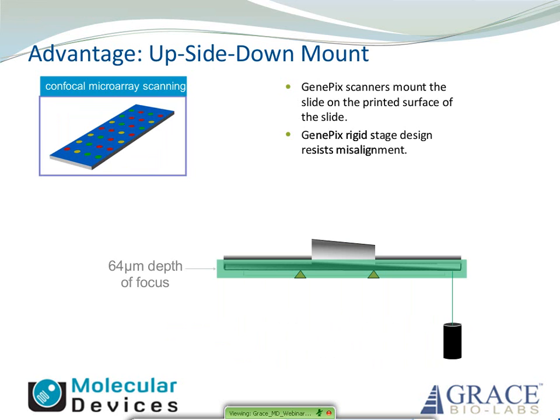And actually, I assume you'll be interested in the highest data quality possible. So because of that, you'll probably want to go with a non-confocal scanner for your protein arrays. And I know that there are a lot of problems and issues when you first start out dealing with protein microarrays, and you don't want the scanner to be part of this.